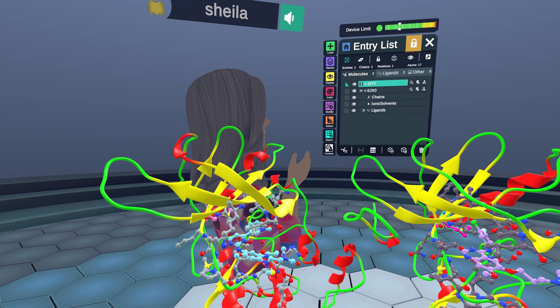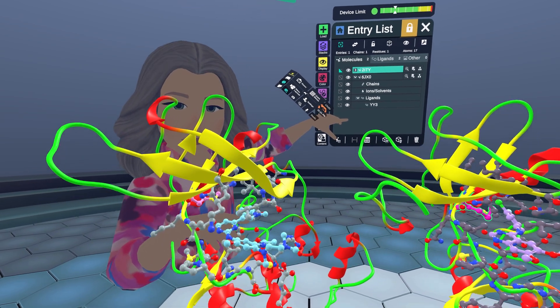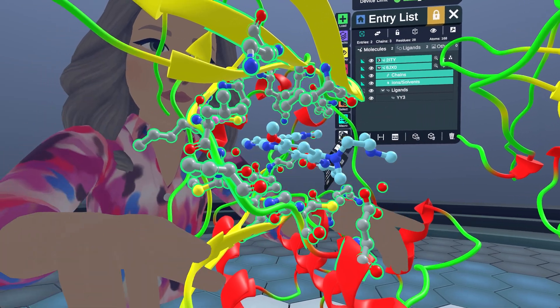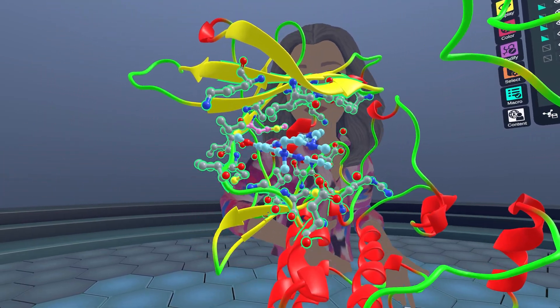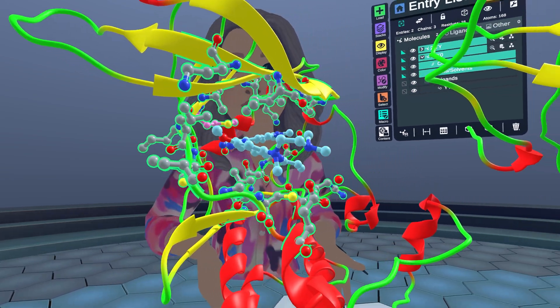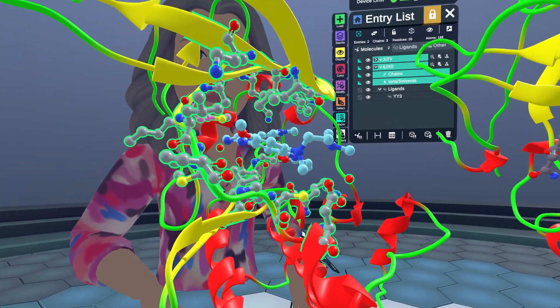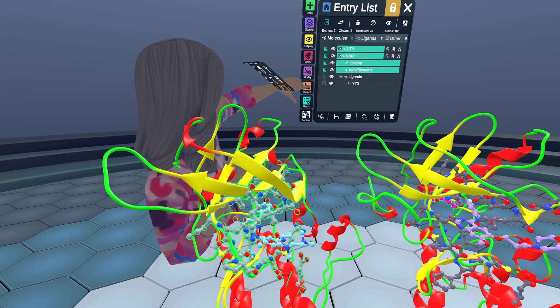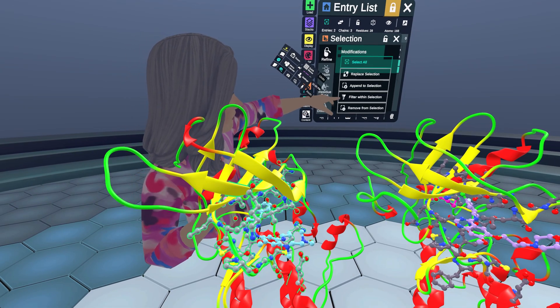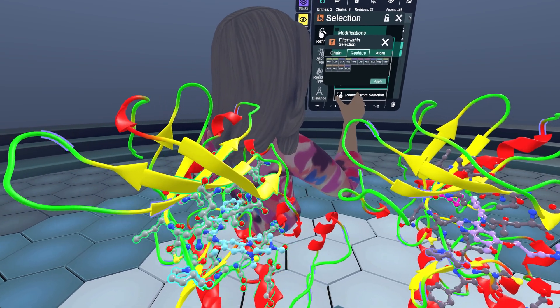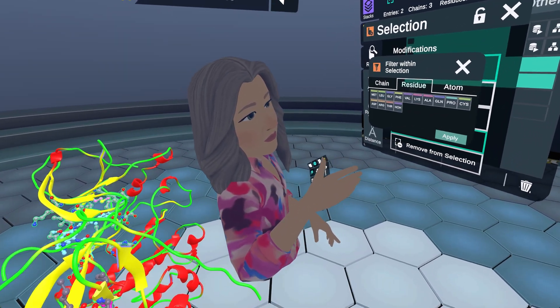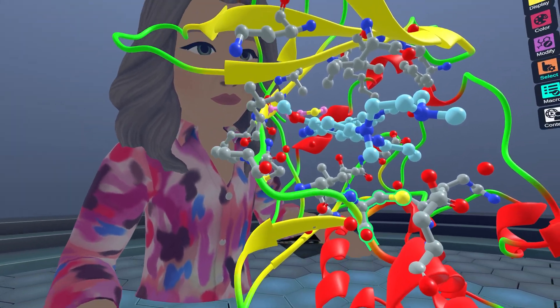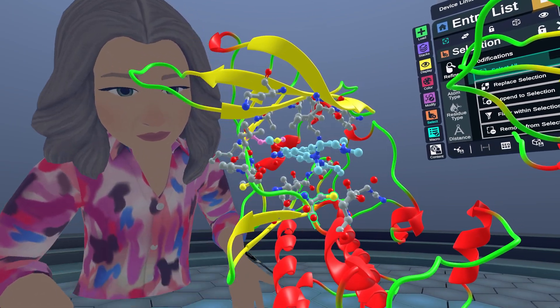I'm going to use a technique in Nanome where I go to the bound ligand in light blue and select the surrounding residues — all these surrounding residues are highlighted, focused on a five angstrom radius. Now that I have those selected, I can use the advanced selection menu in orange and filter within this selection looking specifically for cysteines. If I select cysteine and click Apply, I will have highlighted the cysteine residues in the protein.